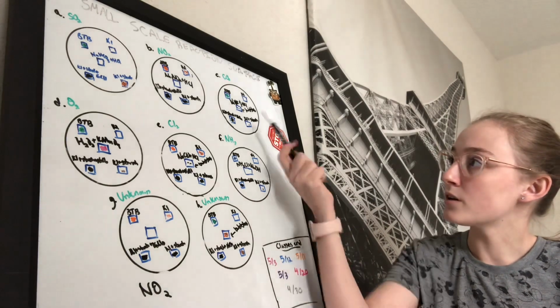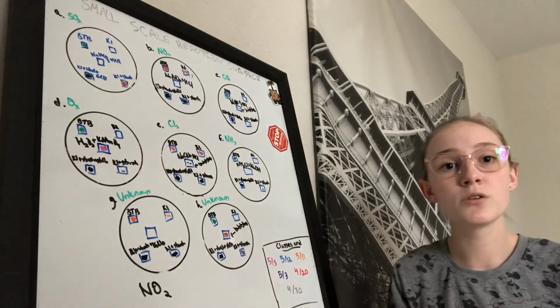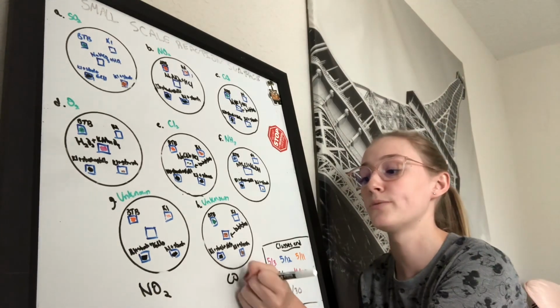And then with this one, it has the same properties as here. You can see it's almost all the same. It also has bubbles, so you can come to the conclusion that this is CO2.